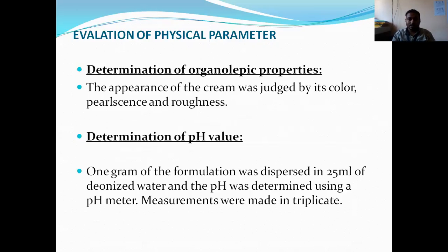We are discussing the evaluation of physical parameters. The first one is the determination of organoleptic properties. The appearance of the creams was assessed by its odor, color, and presence of rancidity.